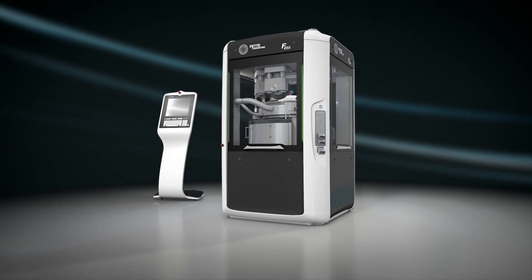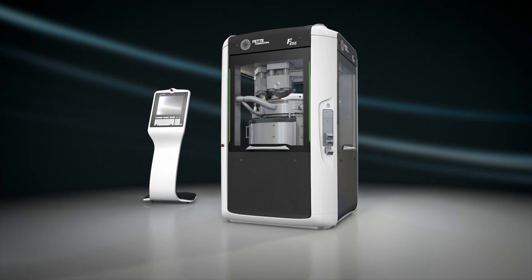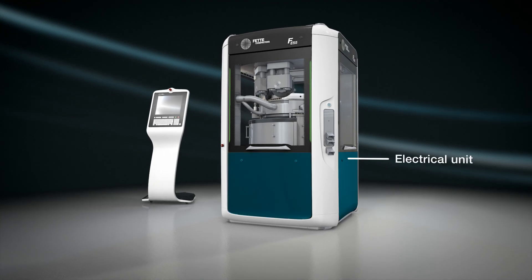The manufacturing of tablets is performed on a tablet press, which essentially consists of an electrical unit and the tablet press area.